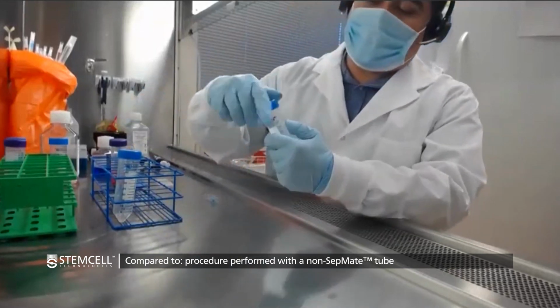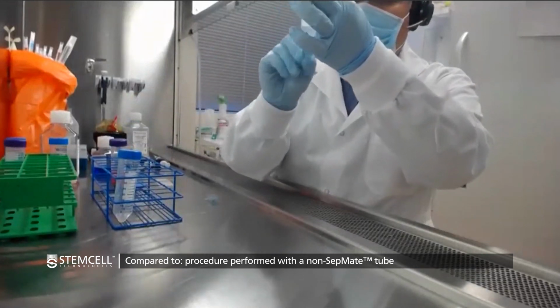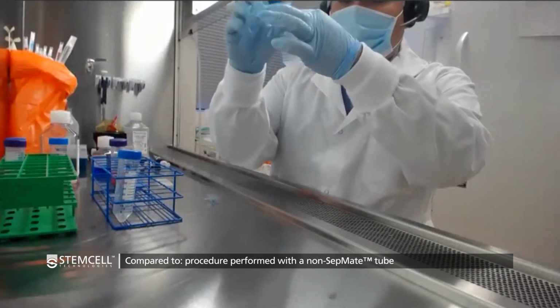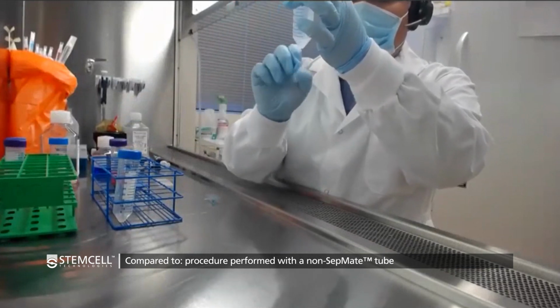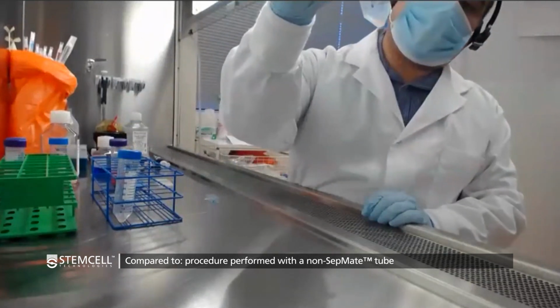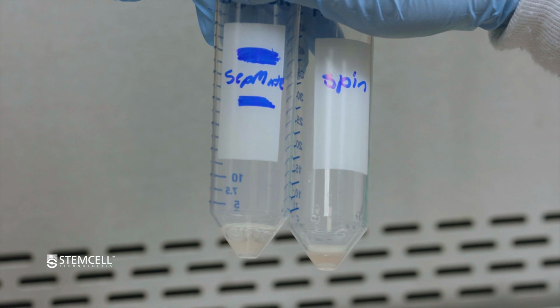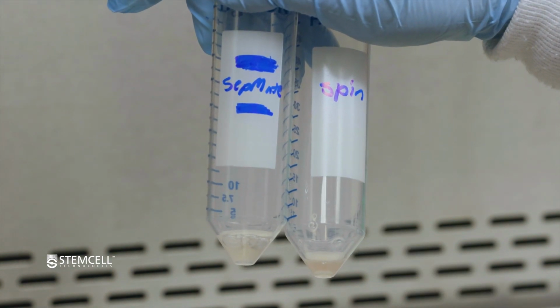And then you will agitate your cell pellet a little bit just to break it off. Always easier to break apart the pellet when there's minimal volume. You can see very, very similar to our SepMate. The color actually looks very similar, I think. If anything, I would say that the non-SepMate looks a little bit redder.